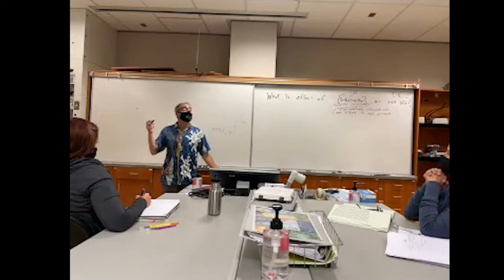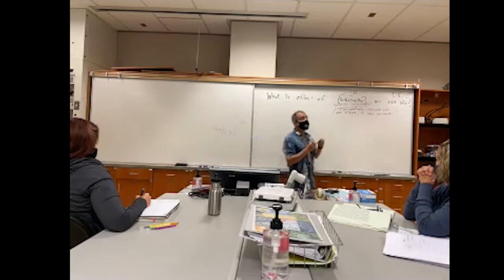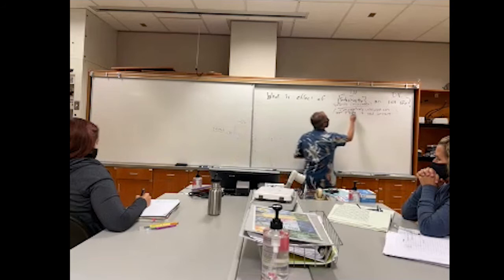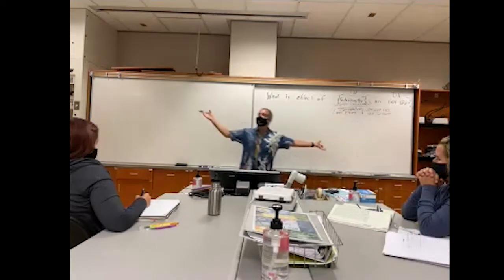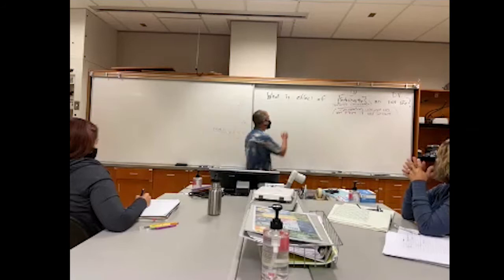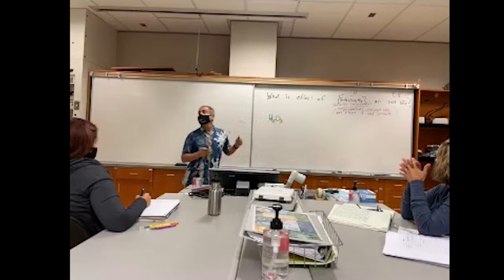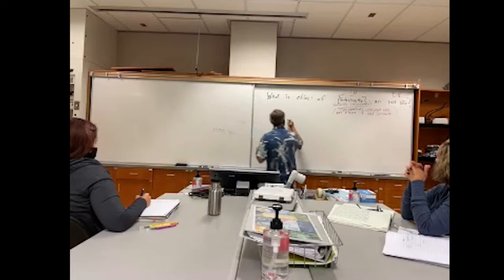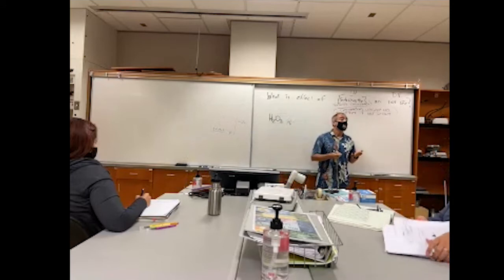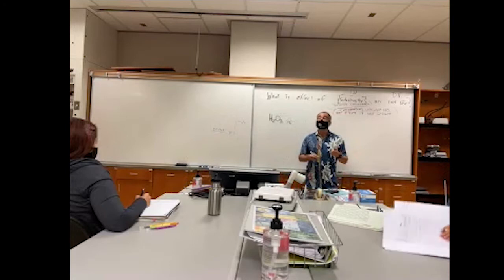In our experiment, we're doing hydrogen peroxide as our substrate. The enzymatically catalyzed reaction that we're going to use as our test for today is just hydrogen peroxide, H2O2, which is a liquid. You've seen it, it looks basically like water, but it's way more reactive.